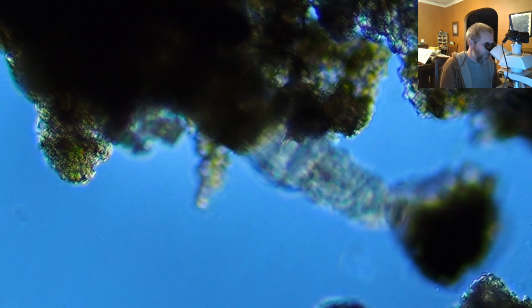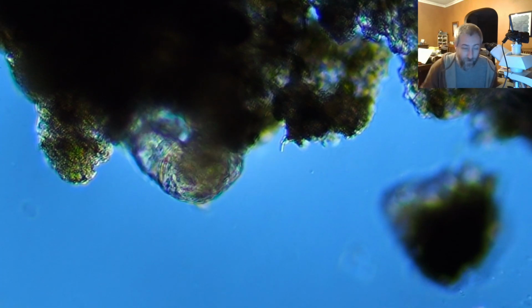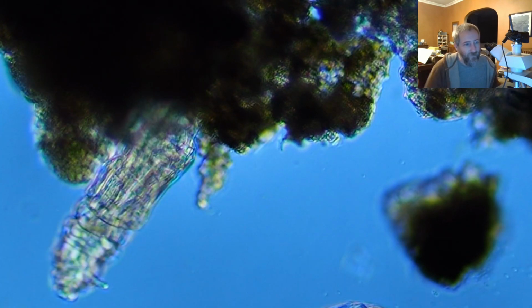Yeah, there's lots of these rotifers in the sample, and I can zoom in a little bit on them. Again, they like to hide under and around things. That thing that's coming off the top of its head is called an antenna. I don't really know what they use the antenna for, probably trying to sense their environments.